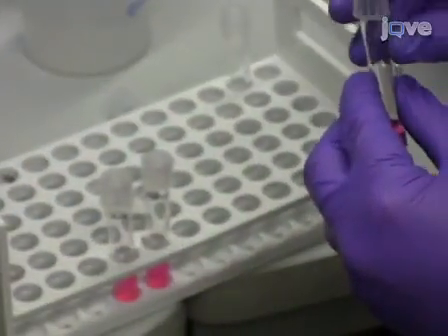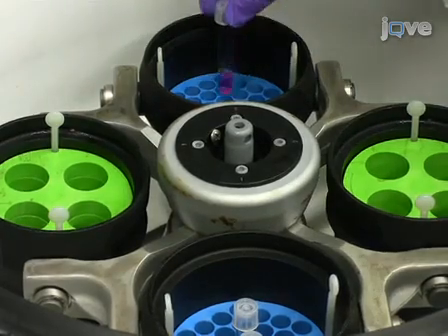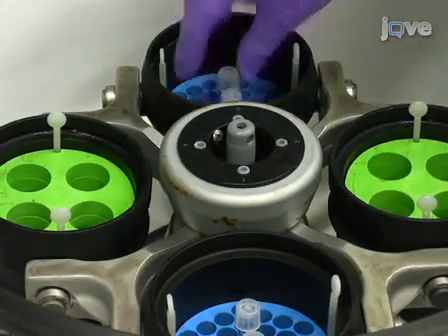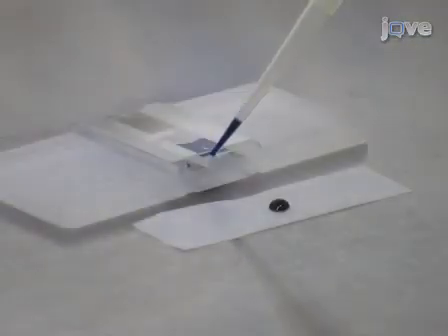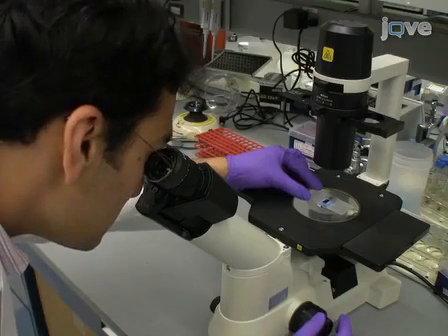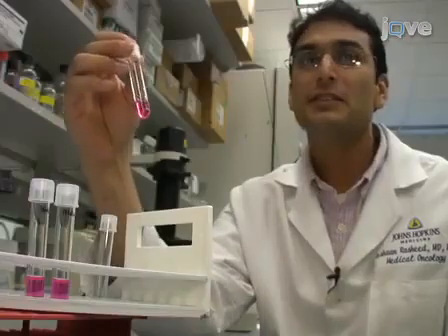After each cell population has been sorted, centrifuge the cell suspension at 450 g for 10 minutes and resuspend the cells in 500 microliters of fresh DMEM supplemented with 10% FBS. Count the number of sorted cells using a hemocytometer. This procedure will result in the isolation of viable pancreatic CSCs. These cells can be used for a number of analytical and functional assays requiring viable cells.